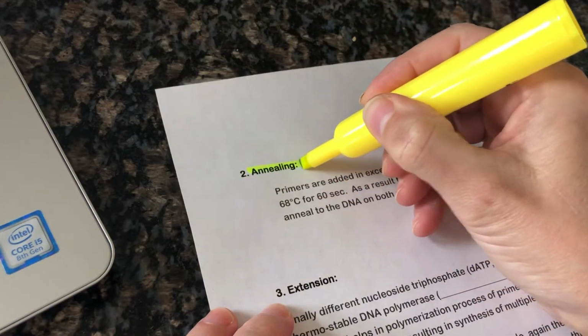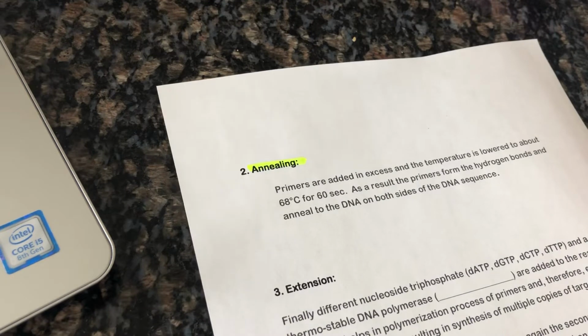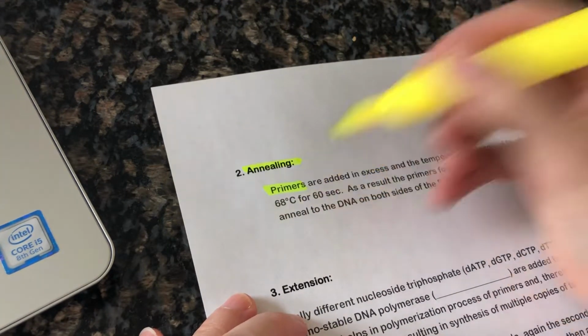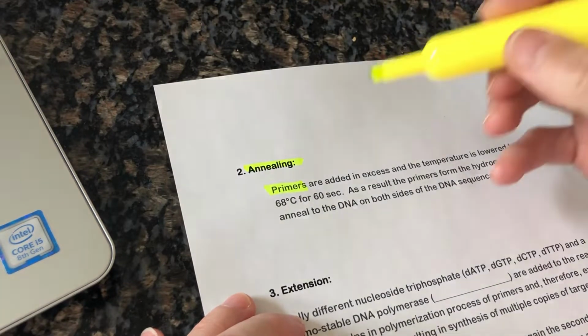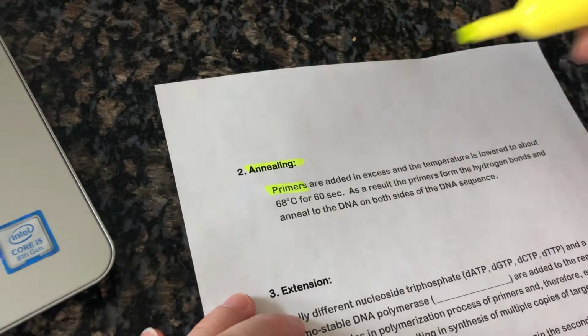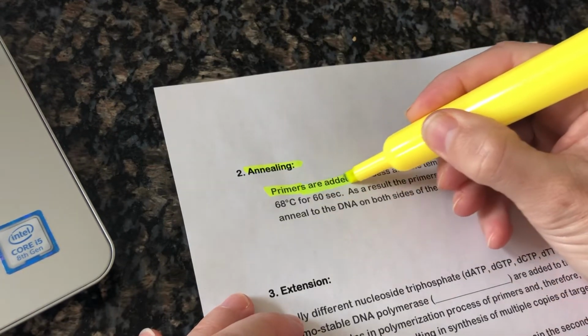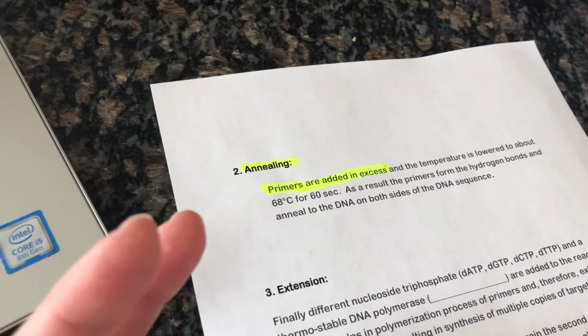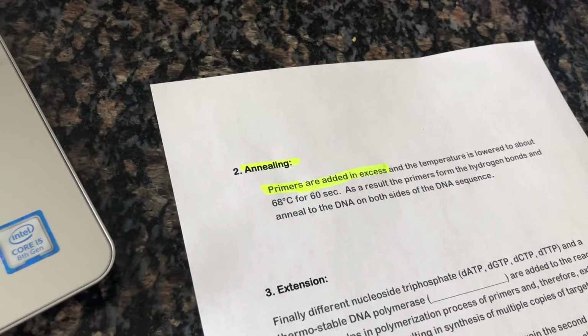Next, we anneal. So we prevented annealing with single-stranded binding proteins. Here we want primers to anneal to the DNA that we've separated. So separate the DNA in denaturation and then get some primers in there, and they're added in excess. So I wanted you to know that in excess. In other words, there's lots and lots of primers put in there. So it increases the chances of the primers binding to the DNA strands.